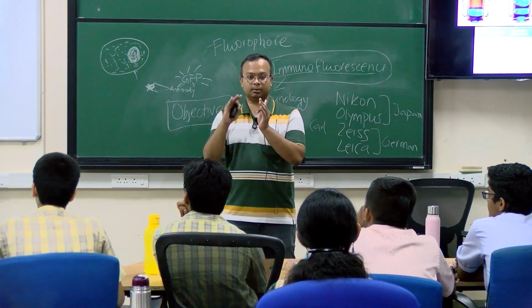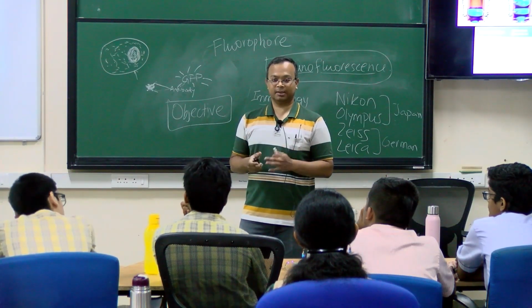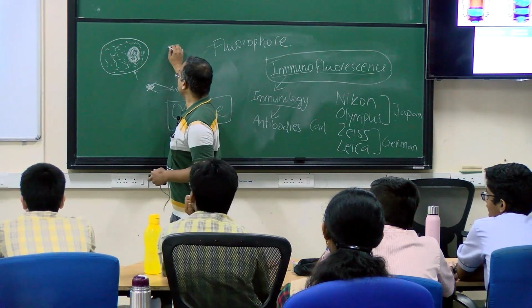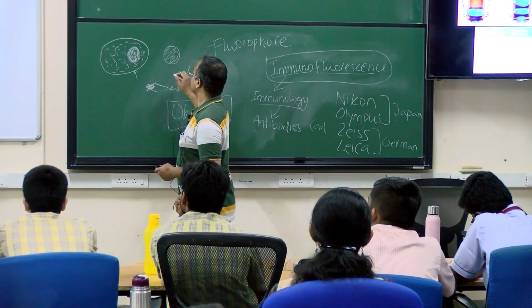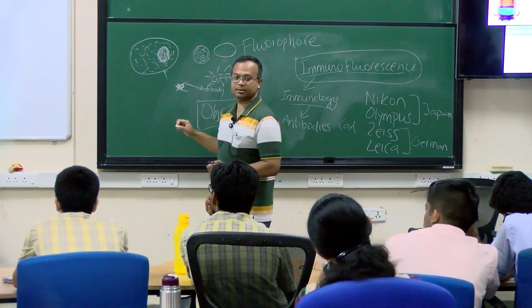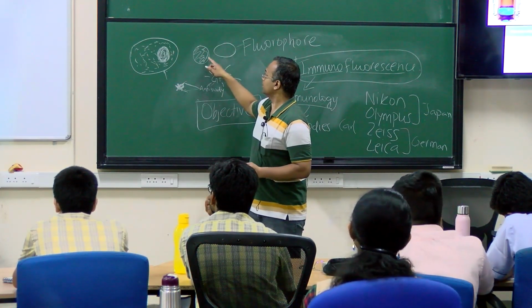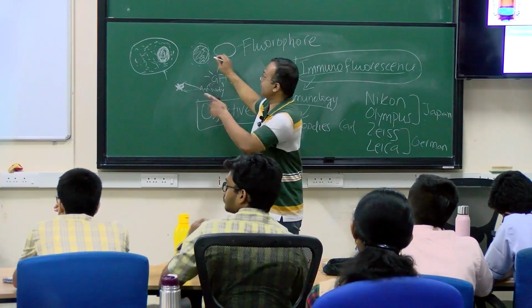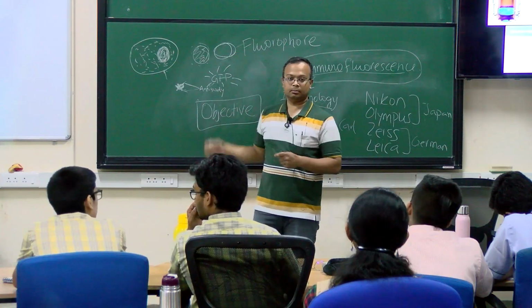The colors can also get bent. Yes. So if I know that this nucleus is circular in shape, and it is labeled with the blue color, this nucleus can appear like this if I don't do any correction. It can get slightly rotated. So color correction is needed so that the blue and the green appear on the same plane, and spherical aberration correction is needed so that the nucleus appears round instead of distorted.